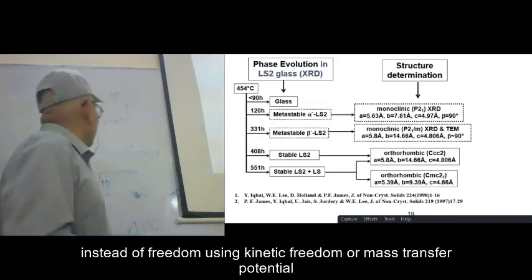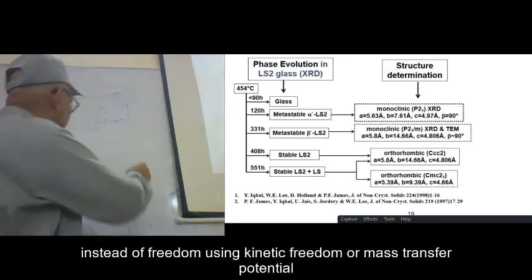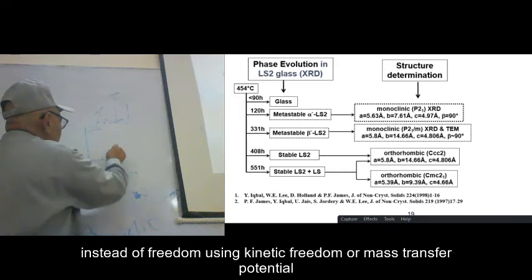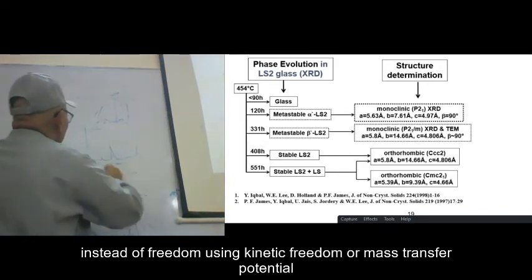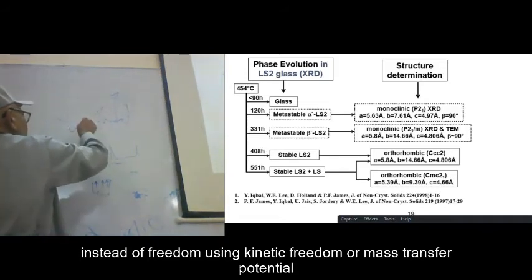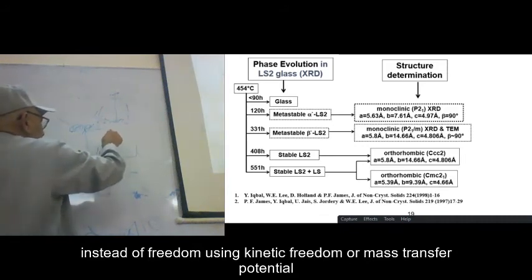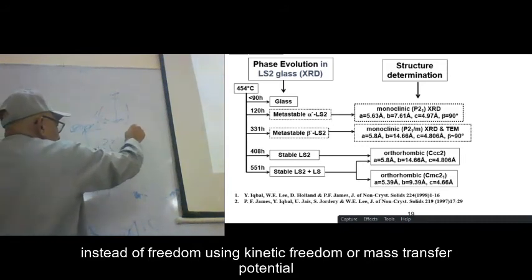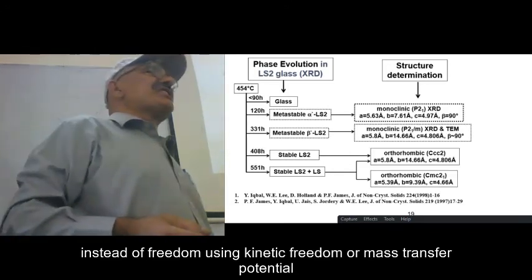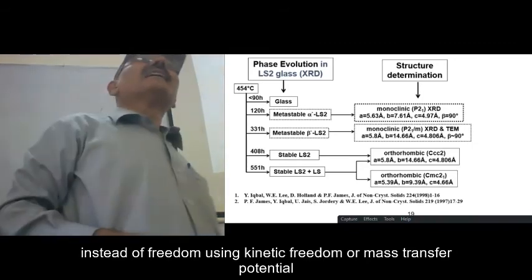So what will it give you? It will give you a diffraction pattern like this: 001, this is, for example, 101, this is 201, this is 102 or 202, something. These are the Miller indices. It gives you maximum intensity for this. This is wrong.